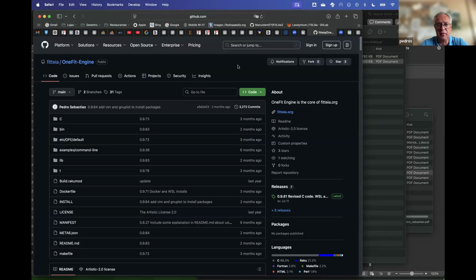And then you can really benefit from the fitting engine, and from not spending so much time uploading data to a fitting package like Fitea or something else, and dealing with all these clicks and choices and tests and customization that you have to do every time, or pretty much every time, you fit a new data set.